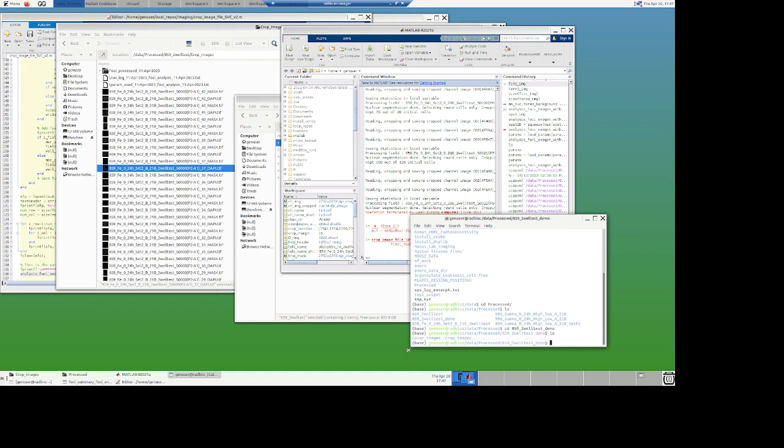And we have those two directories, crop and color. If I go into crop, now the bad thing is because I killed it, I don't have my output file. It's kind of unfortunate. See, it's all the mask and TIFF files, but I don't have any output.